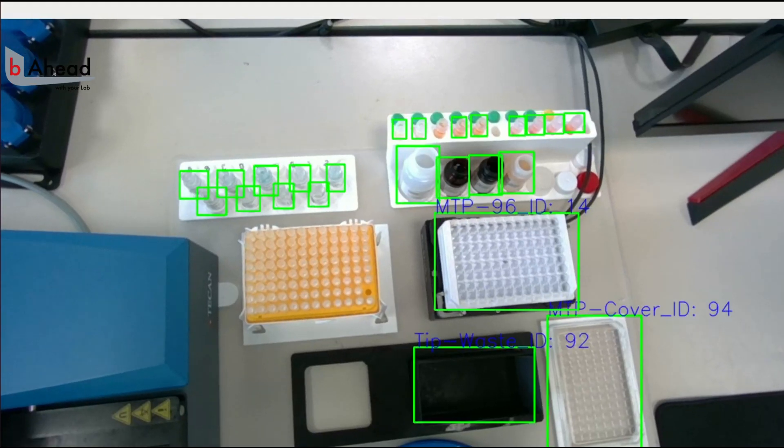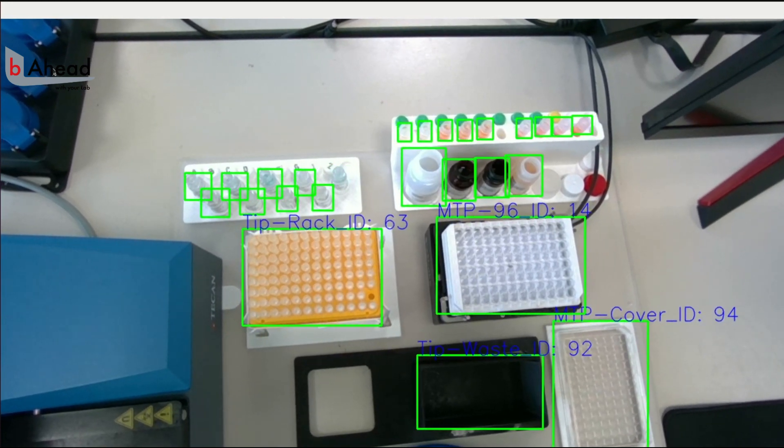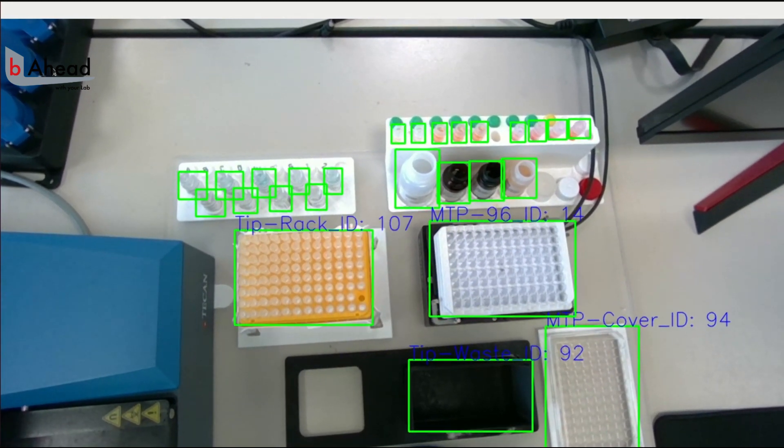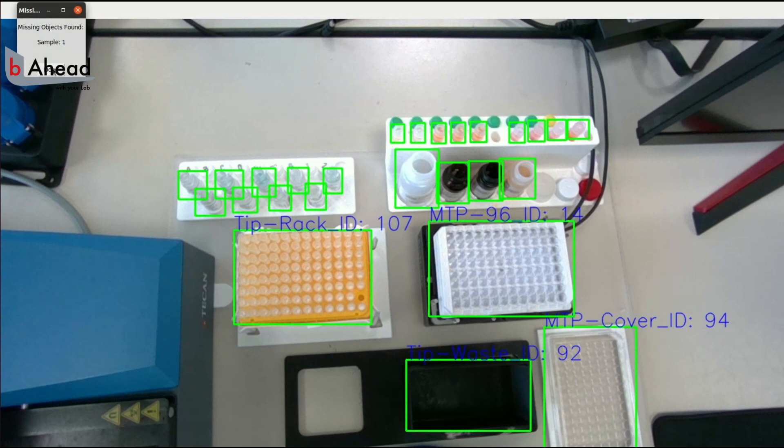Before our buddy starts the workflow, a few visual controls are done to proof the readiness of the application. In this video, you can see us checking if all necessary objects for the application are present in a given scene.